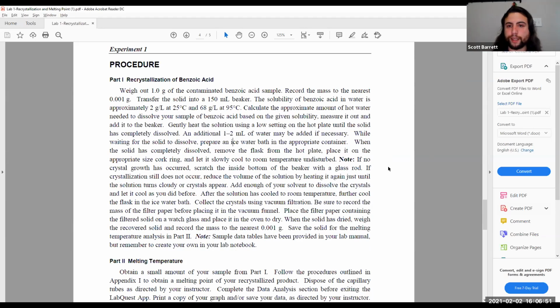And also that's another thing in lab, and you probably know this, that people have told you before: never take something that is extremely hot and then put it into something extremely cold, because the glass will shatter. So that is one safety tip that you should know as well, just in your daily life.